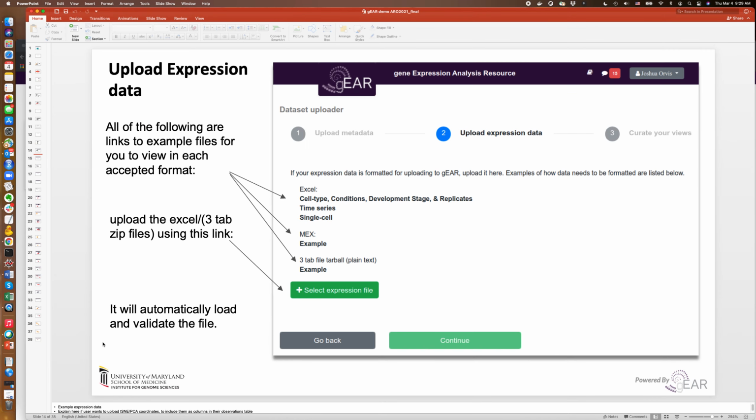This is the demo for making the static t-SNE plot and Violin plot. If you are interested in other display options, please go through the PowerPoint that I displayed at the beginning. There are more demos for bar plot, line plot, dot plot.